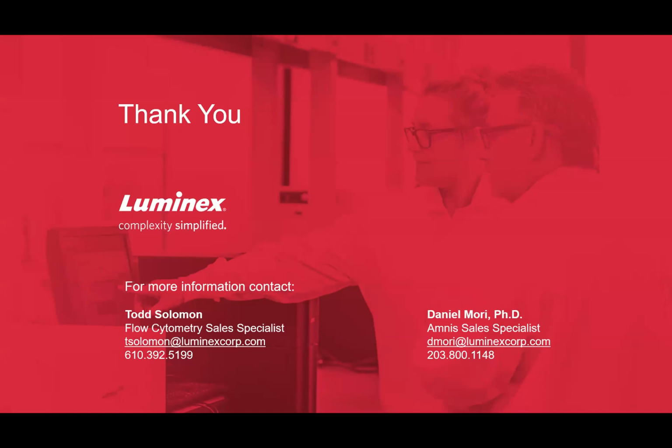Okay, great. And then Tina actually had a question: what are some of the challenges in transferring an experiment from traditional flow cytometry to imaging flow cytometry? And what resources might be available to assist our researchers that are looking to make that transition?